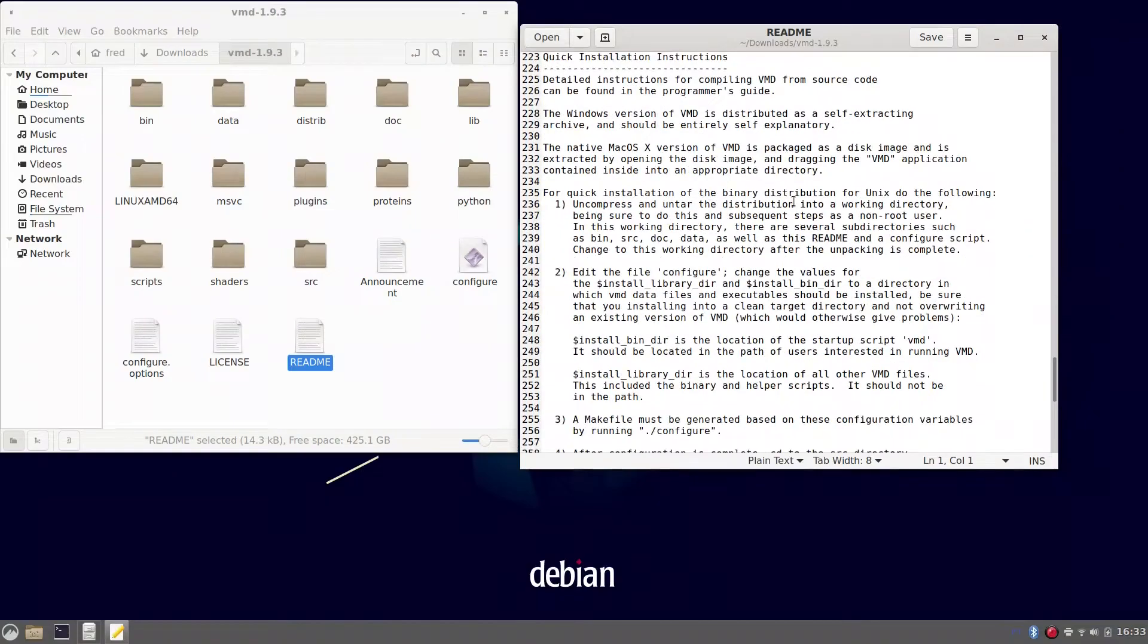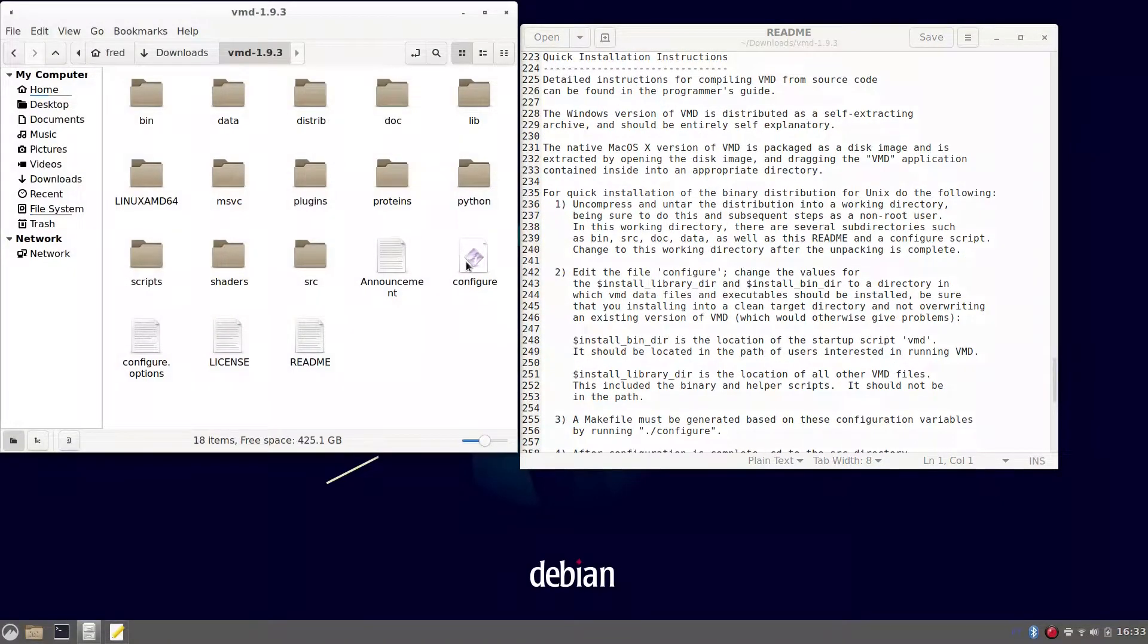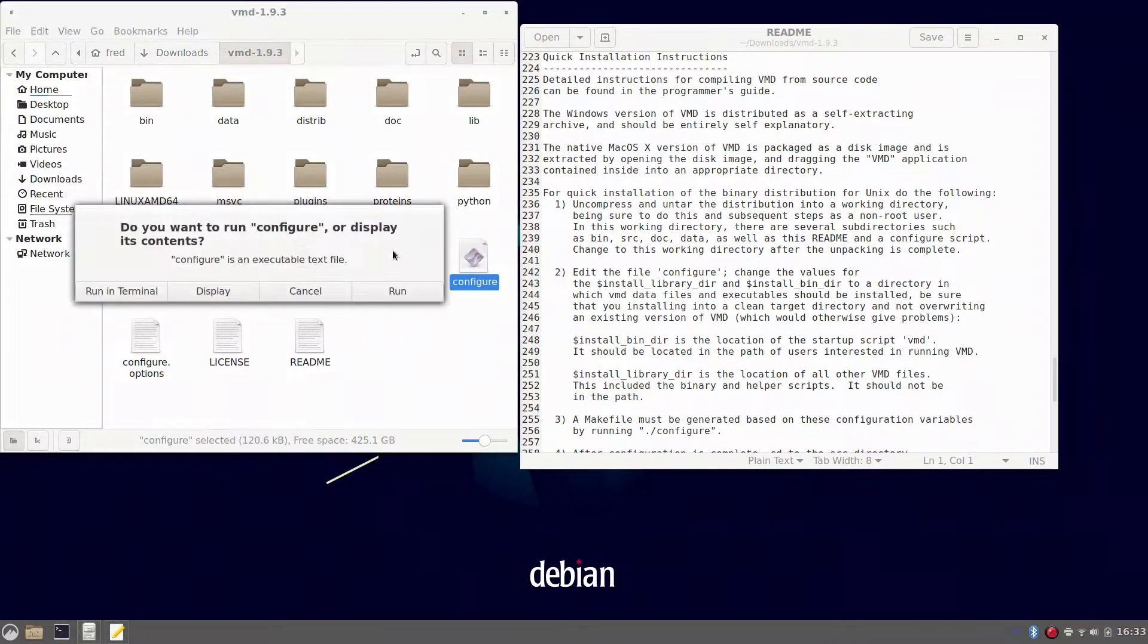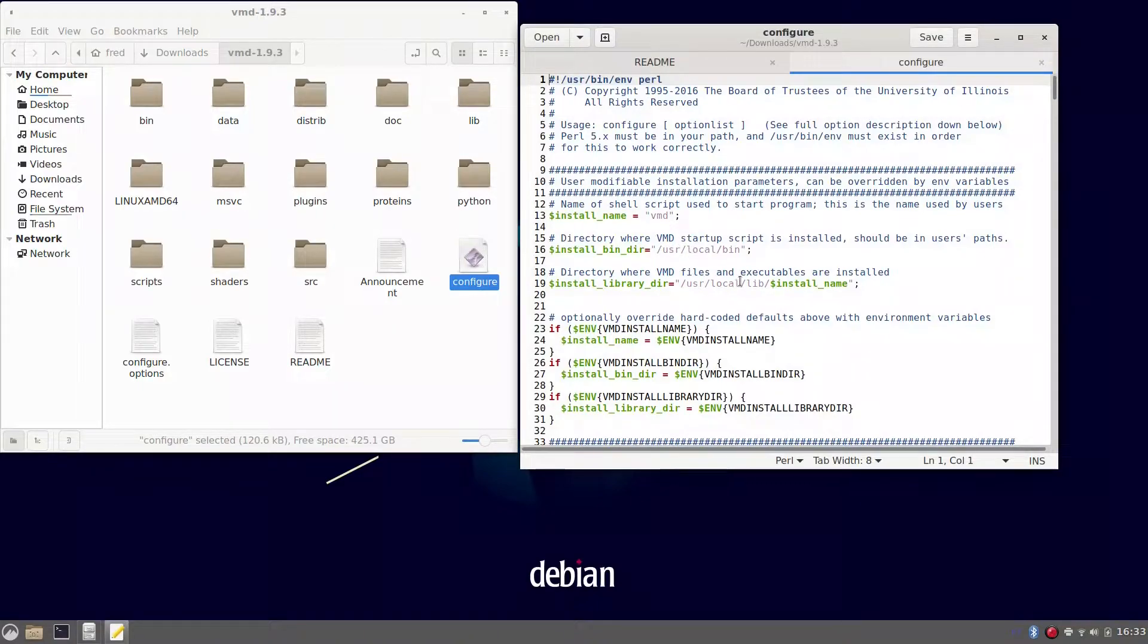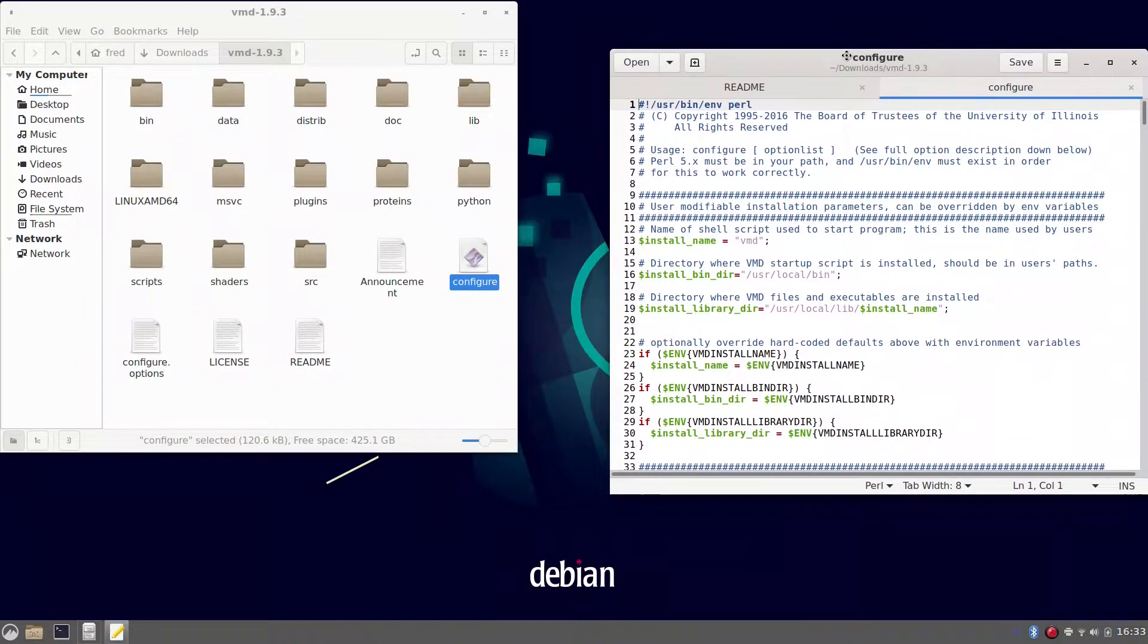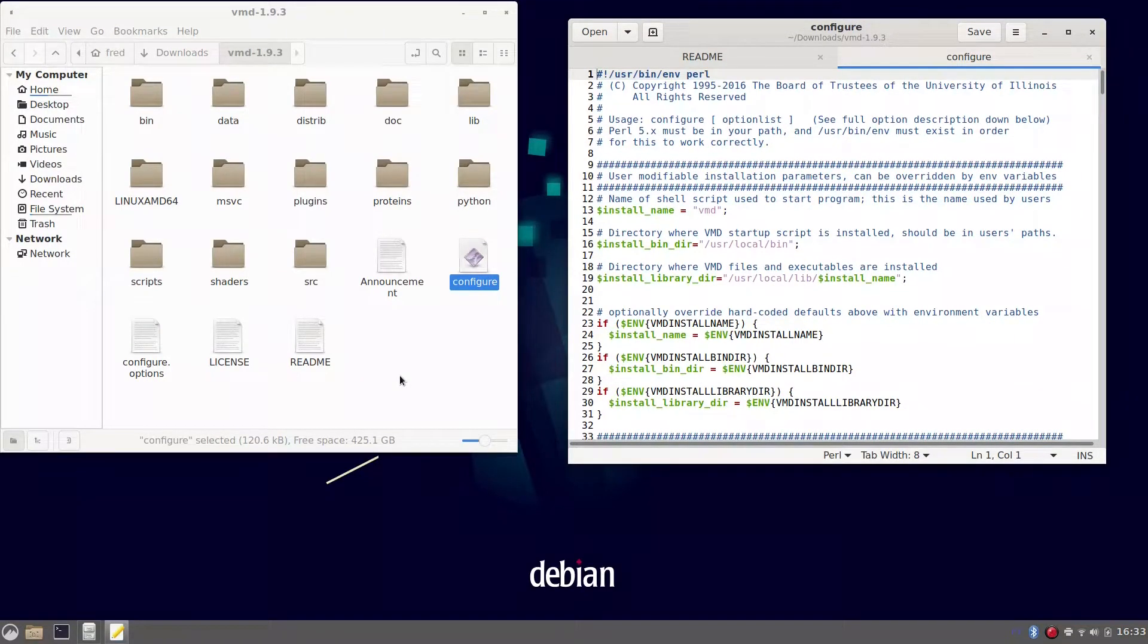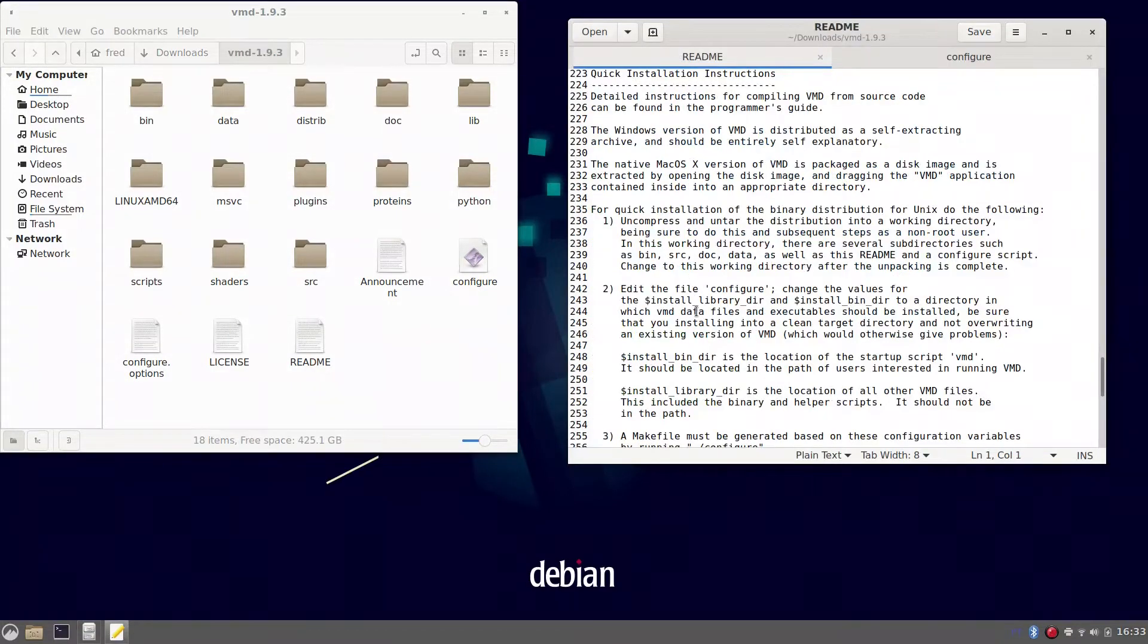So looking to that, if you need to edit the configure file, we are not going to do that because we are going to proceed to the standard one. Those are the place where the launcher and the library will be placed after installation. To proceed to the next step, you have to open a terminal here.